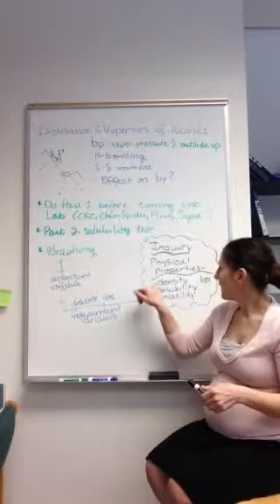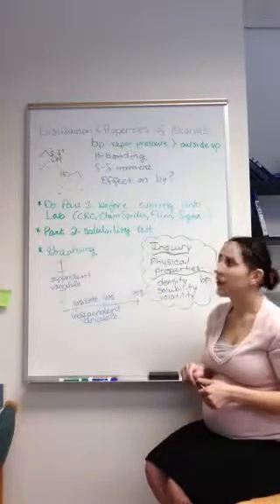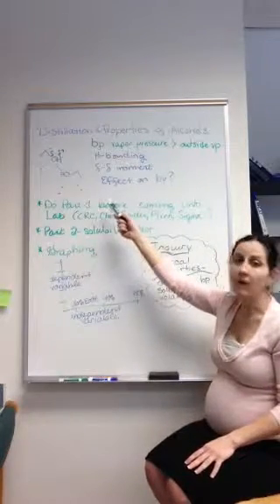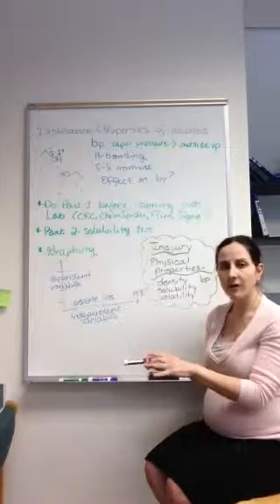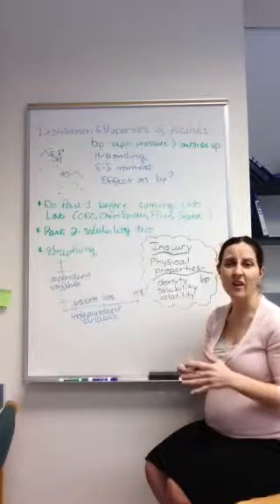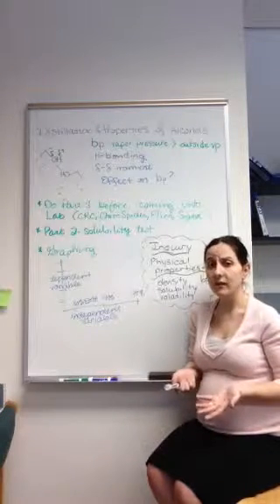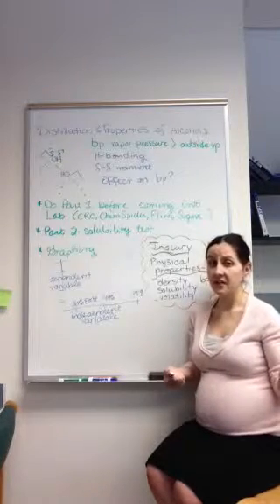Another thing is we looked at density a little bit, but is there a way that you could measure further properties of density? We were just looking at alcohols in this lab, so maybe alcohols versus an alkene, or alcohols versus a ketone. You can look at functional groups that we haven't talked about yet in class, and then find things out on your own.